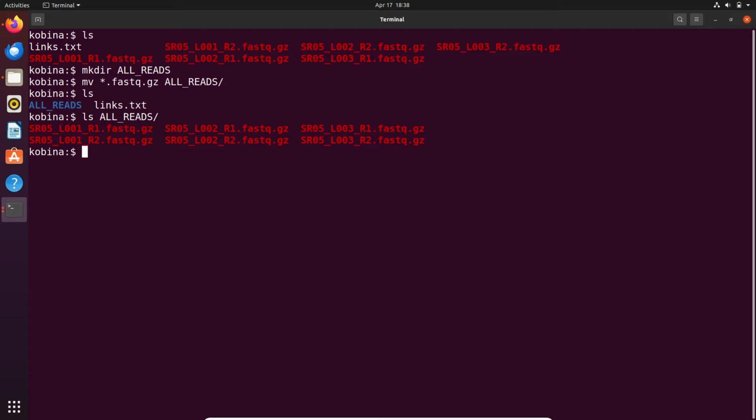Okay, so the command we are going to use is cat. All right, now let's even look at the files that we have here. If you take a look at the files, it's .fastq.gz. That means that these have been gzipped, they are compressed. In Linux, if you want to combine or concatenate text files, we can use what we call cat to do this. Earlier on I even did it. So we are going to use the same cat command to merge the files.